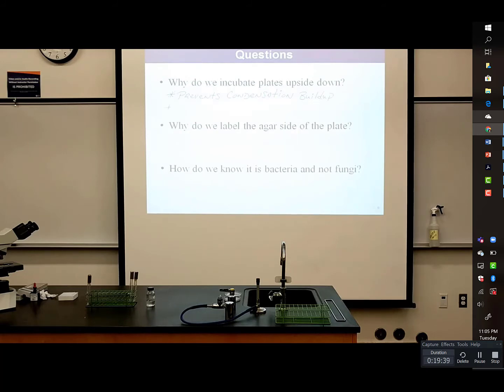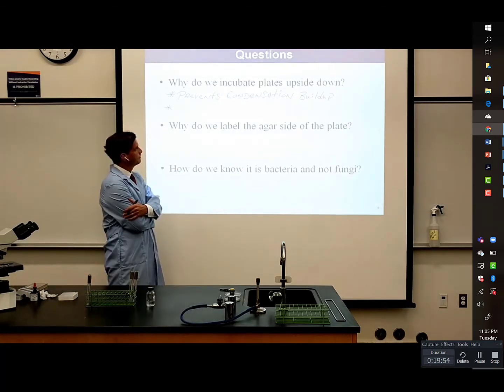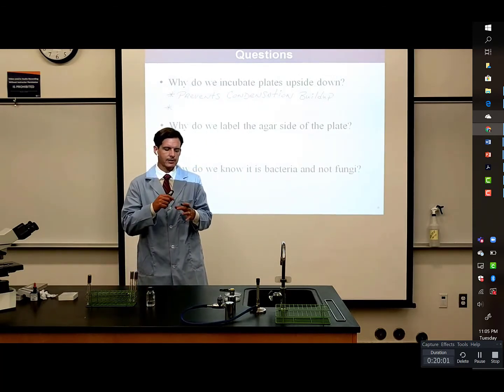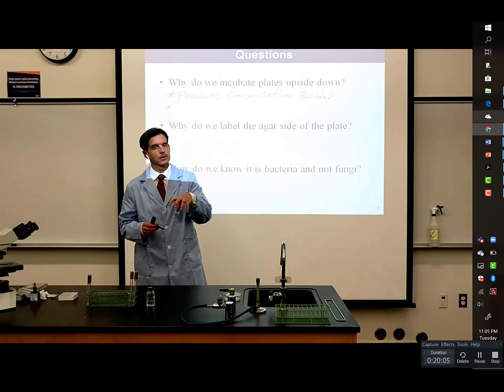Also, another good reason to incubate plates upside down, oh, I didn't talk about this. When you stack the plates, they actually stack better with the lid down because the lid is larger.